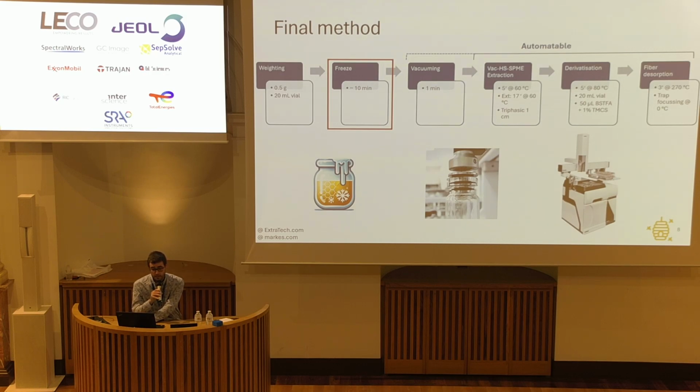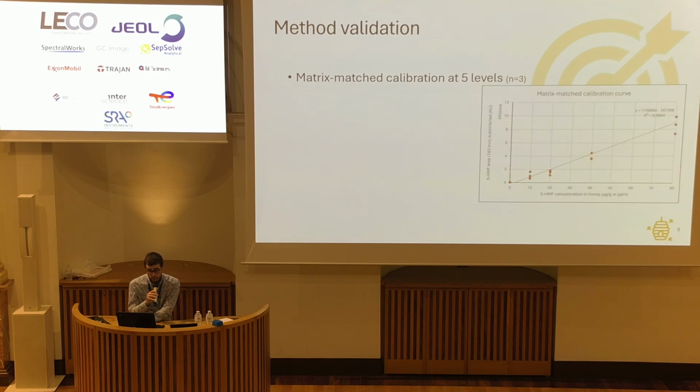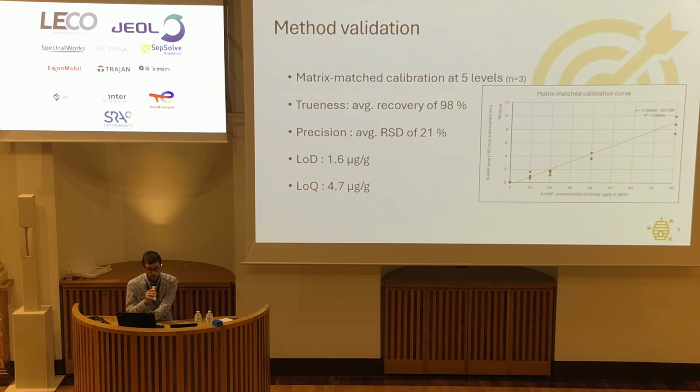The last four parts can be automated, whereas the first one, unfortunately, dealing with a sticky matrix such as honey, is a bit more complicated to automate. So we validated the method through a matrix-matched calibration at 5 levels. Regarding figures of merit, we see that we are fine regarding the SPME method. And for the limit of quantification, we are 3 times below the targeted limit that we wanted to reach.